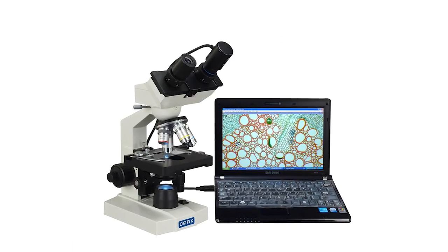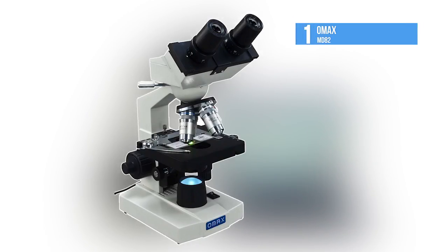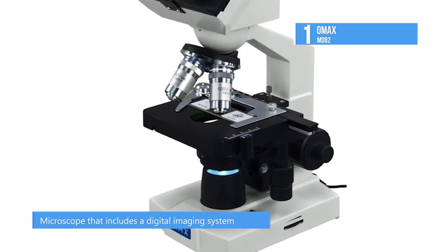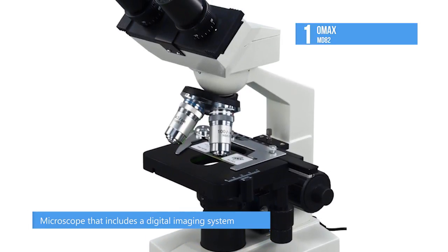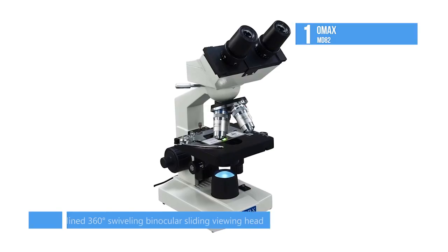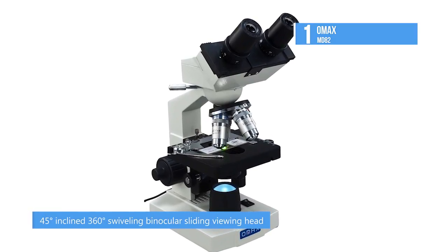And at number 1, top of the list, we have the OMAX MD82. This OMAX binocular biological compound microscope offers 8 magnifications between 40X and 2,000X. The lab microscope comes with a 45-degree inclined, 360-degree swiveling binocular sliding viewing head, 2 pairs of wide-field eyepieces with adjustable diopter on oculars, and 4 achromatic objectives.